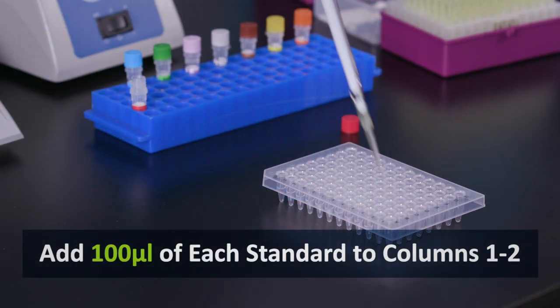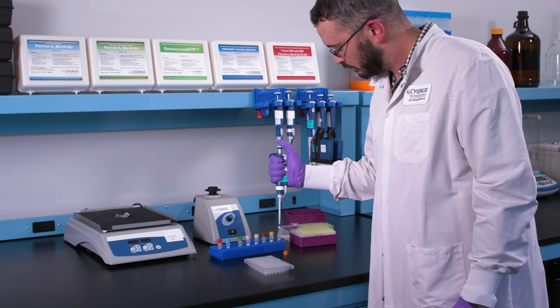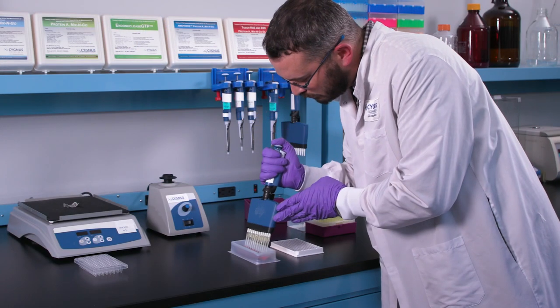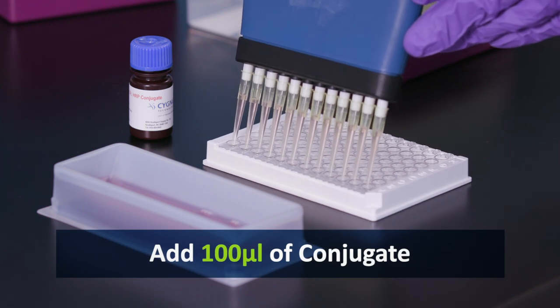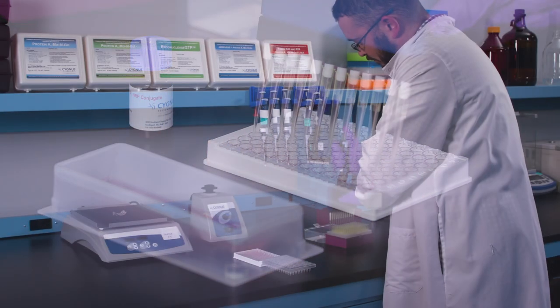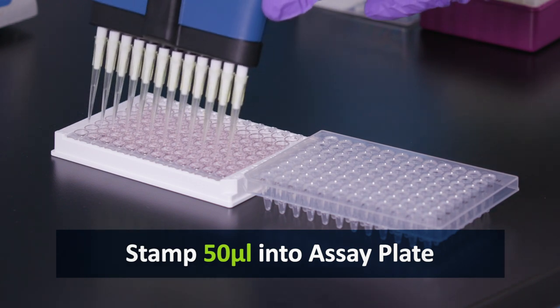Now, add 100 microliters of each assay standard to all wells in columns 1 and 2. Next, add 100 microliters of conjugate to the assay plate. Then, stamp 50 microliters from the sample preparation plate into the assay plate.